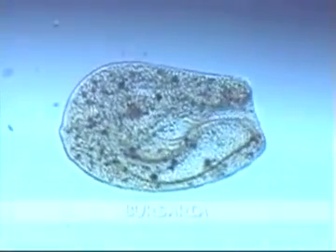One of the largest protozoa is Bursaria. It is a giant in this microscopic world. With a large gaping mouth, it can swallow other protozoa whole. This unlucky paramecium is stuck in this Bursaria's stomach and will soon be digested.